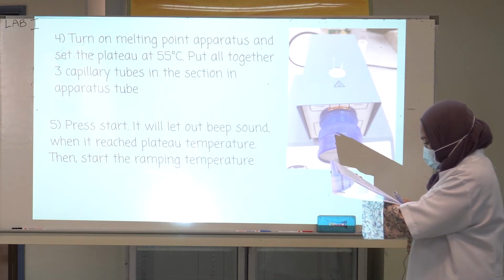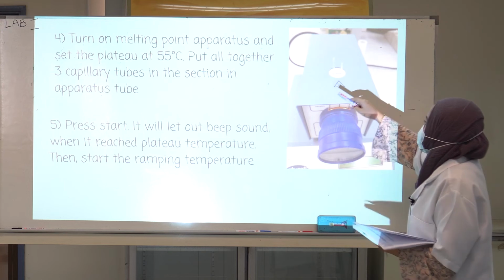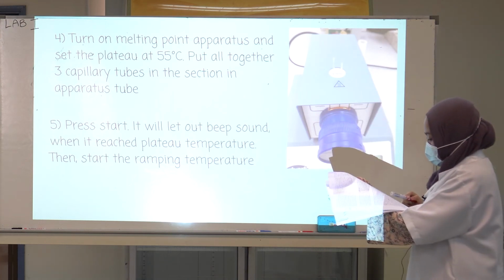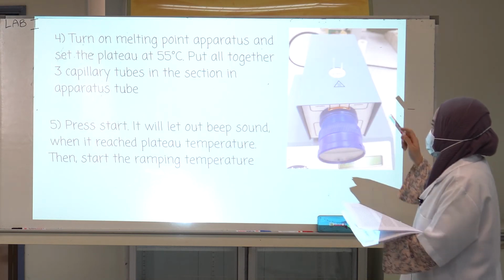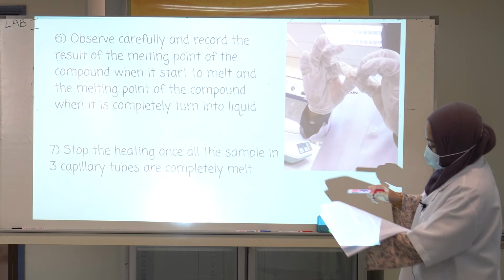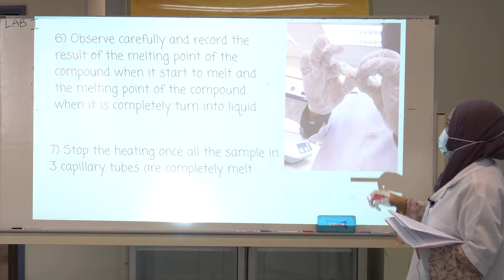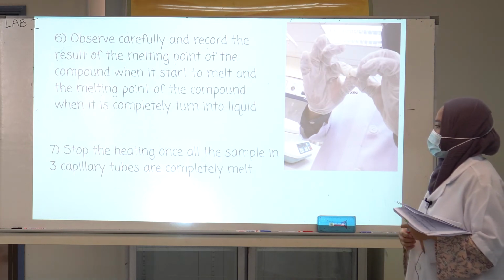And then after it reaches the plateau of 55 degrees Celsius, it will let out a beep sound, and when it reaches that temperature, we can start ramping the temperature. After that we observe carefully and record the melting point of the compound when it starts to melt, and the melting point of the compound when it is completely turned into liquid.